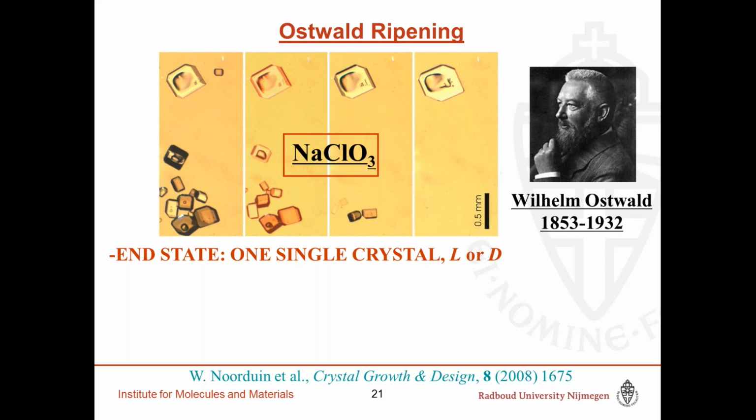And be patient. What we often find is that if you put a vessel with a solution which you have been looking at for days or perhaps weeks on the shelf, and one month later you come back, then it turns out that suddenly crystals have appeared. Of course, patience is in many environments difficult, but this is a good way to proceed, I would say.